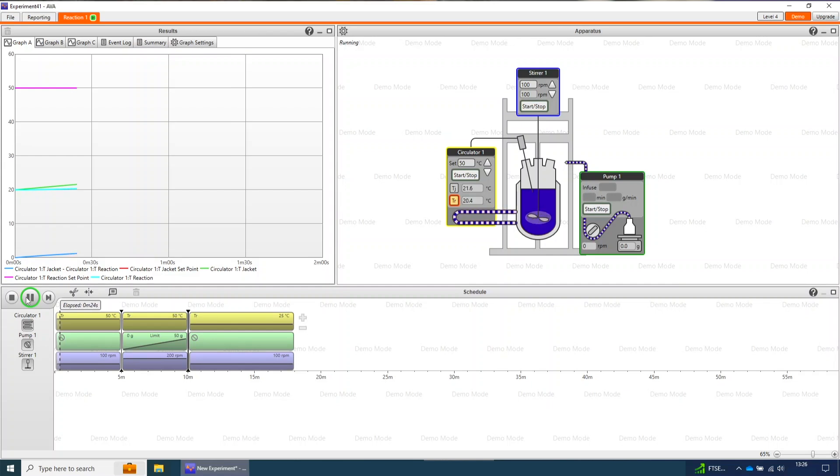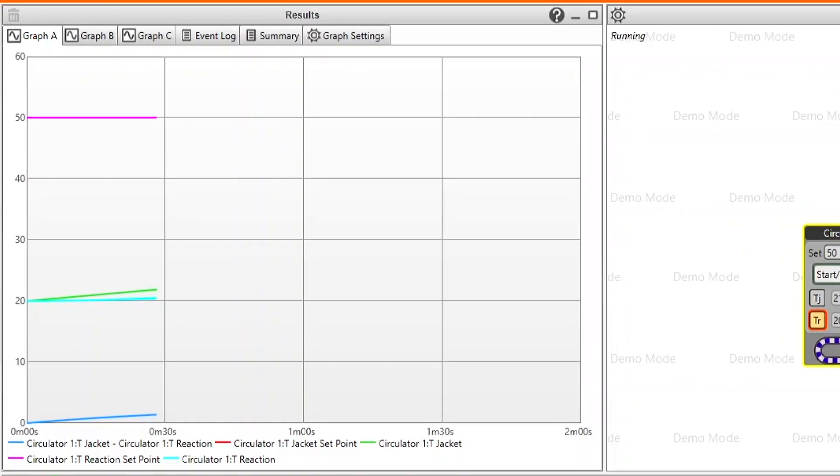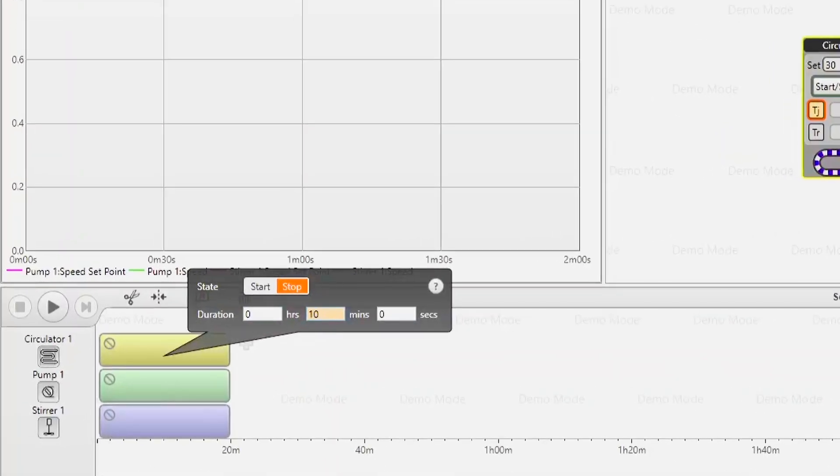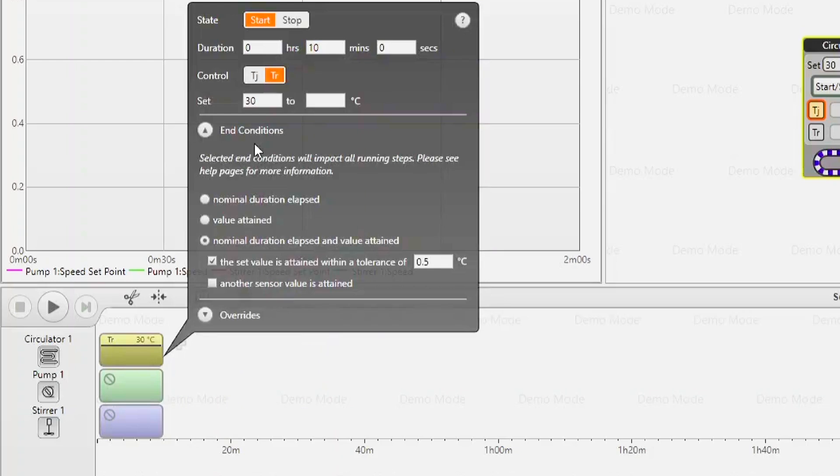The best way to improve yield and minimize the risk of batch failure is to better understand the process. Our AVA software can log temperature, pH, stirring speed, and other parameters throughout your reaction. With AVA you can also create profiles to change your set points at specific times or to slowly ramp from one set point to another.